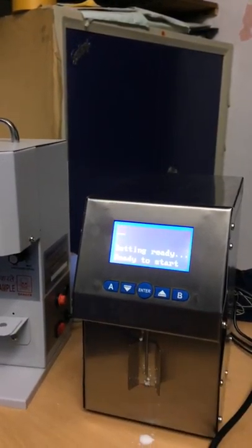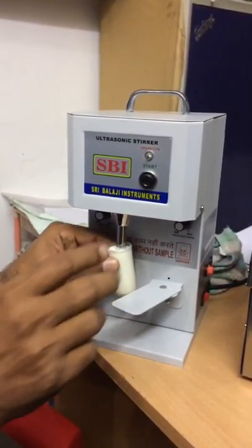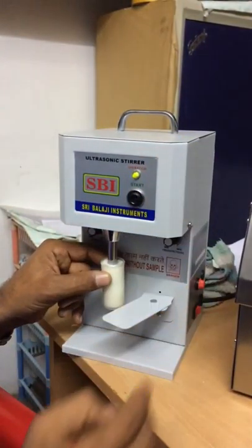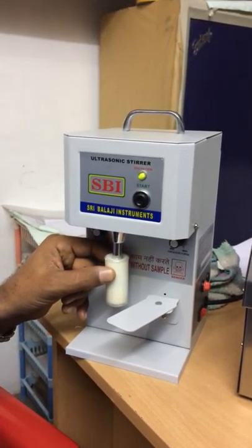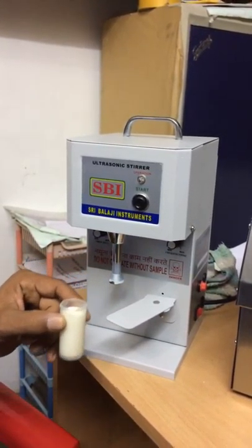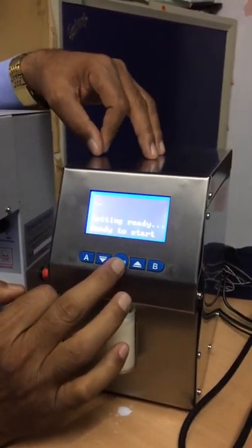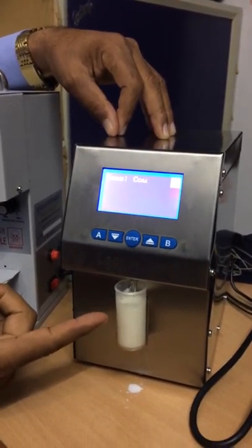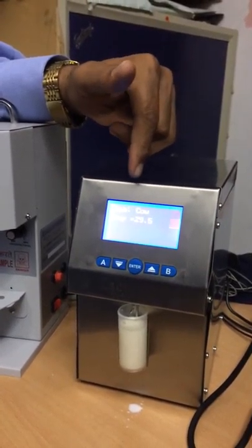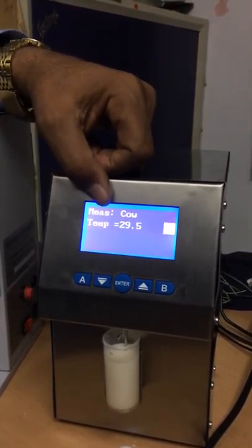The analyzer is ready to analyze the milk. I have a sample milk ready. First I will stir up the milk, then I put the milk here in the milk holder and press Enter. Now see, the milk is going inside the analyzer. The analyzer has started to analyze the milk. Firstly it shows the temperature.